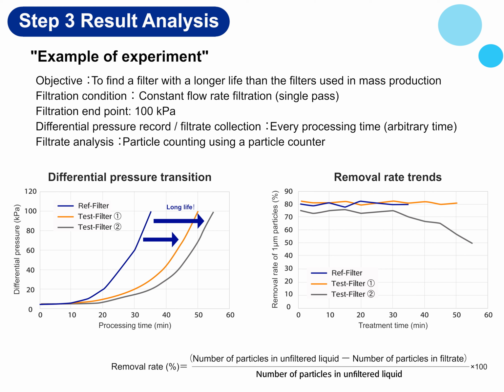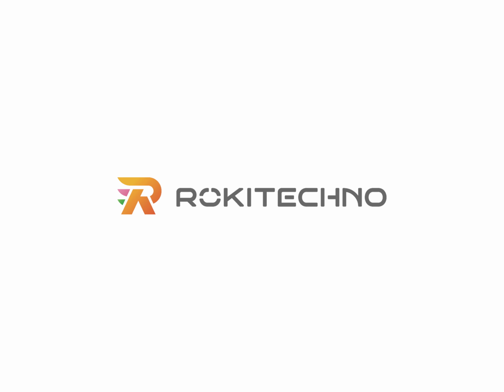Based on the results of these low-volume filtration experiments, moving on to mass-scale testing will lead to more effective and efficient filter selection. We introduced a procedure for small-volume filtration experiments using constant flow filtration.